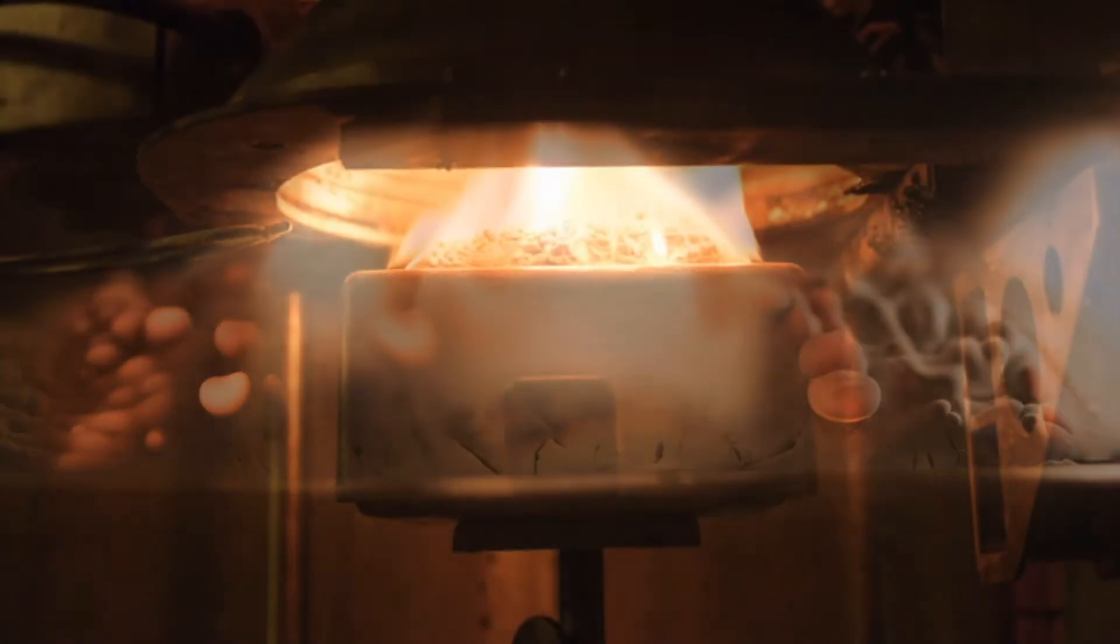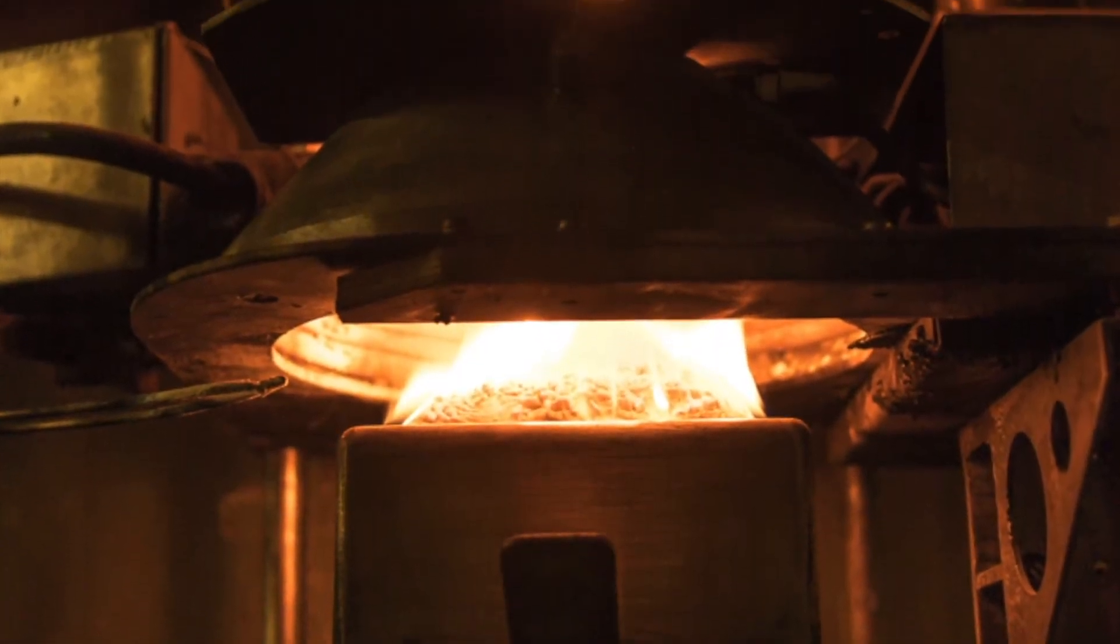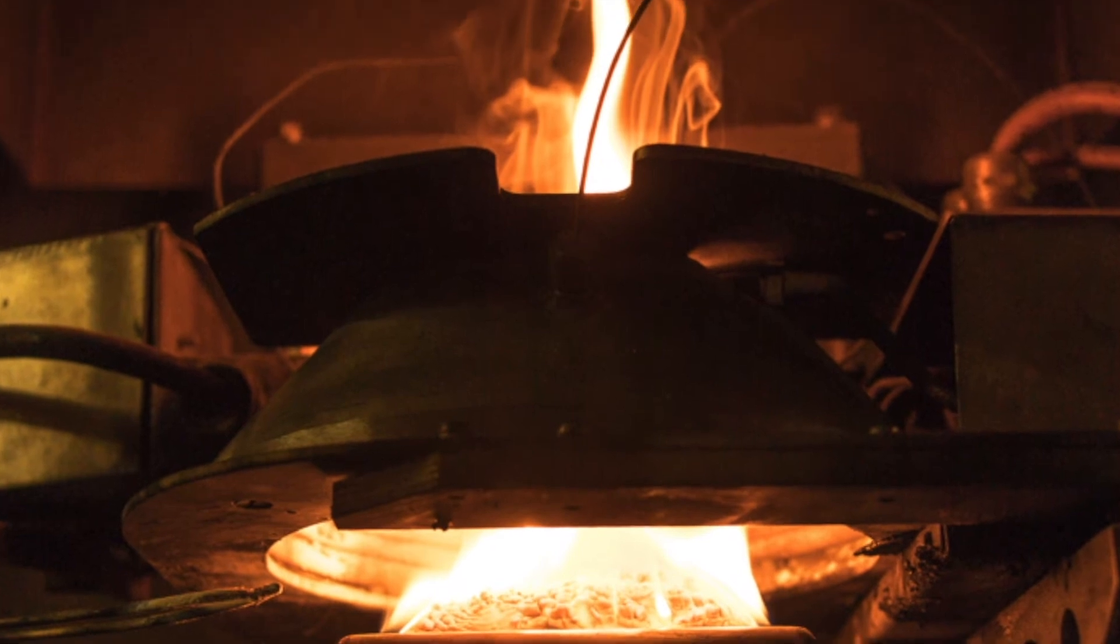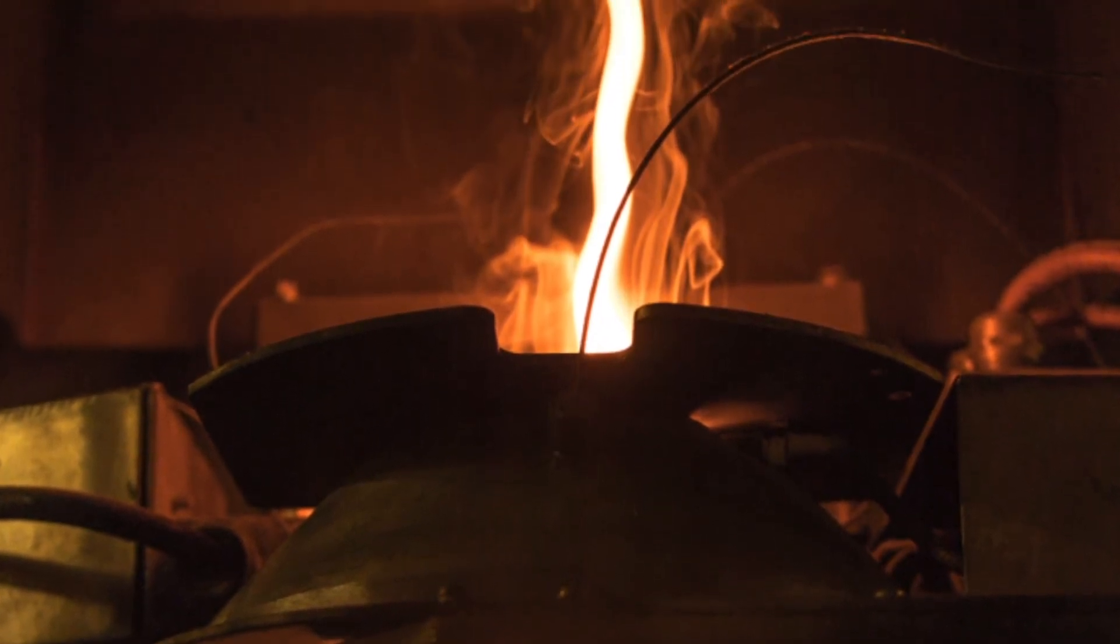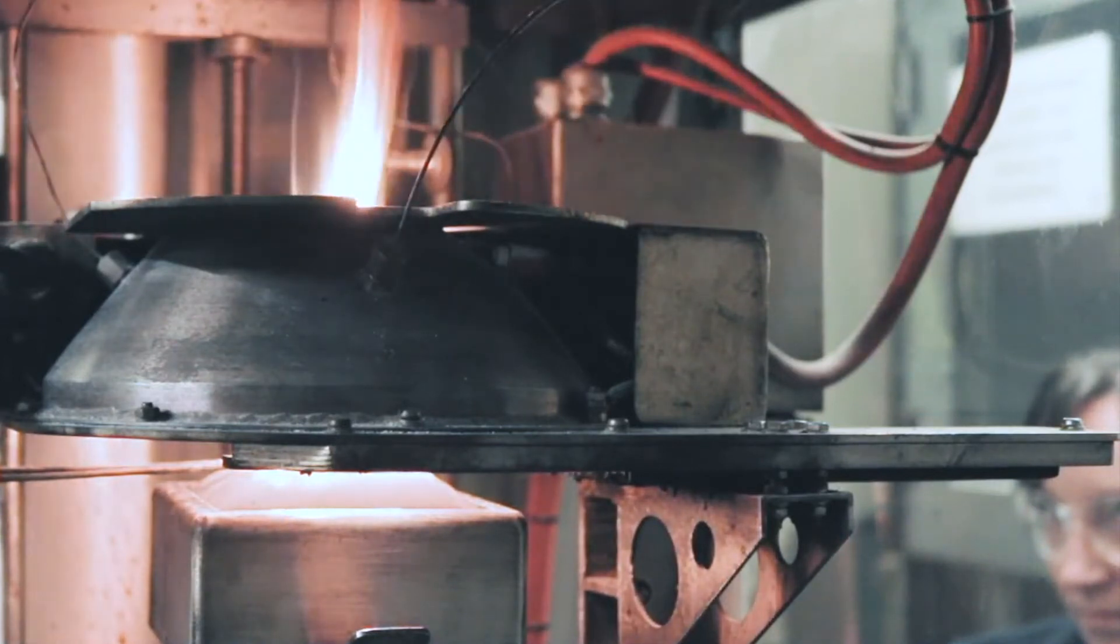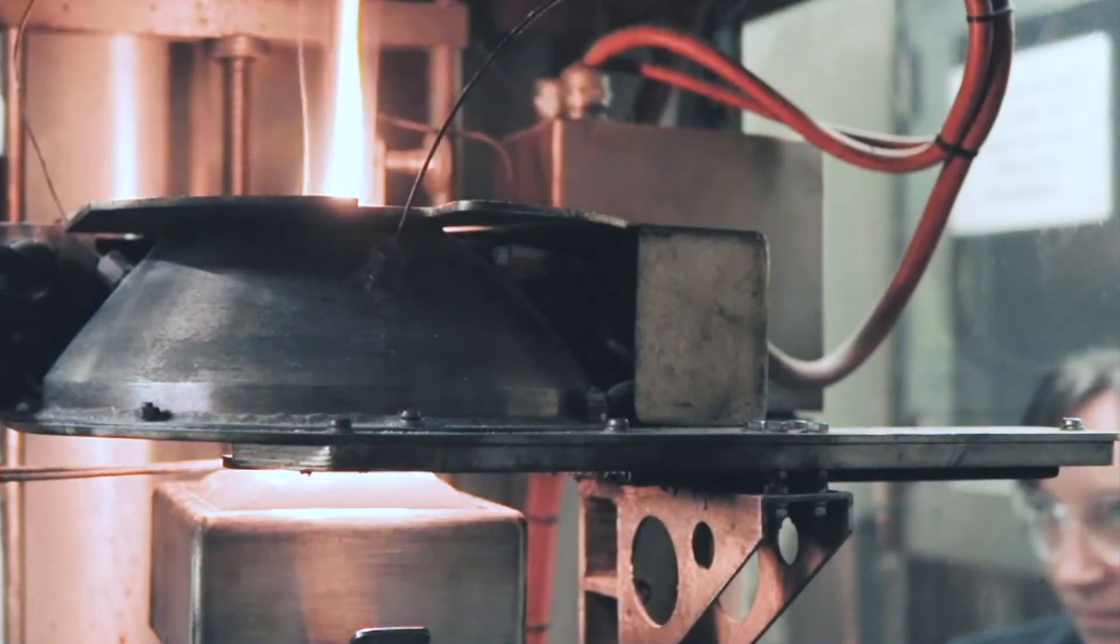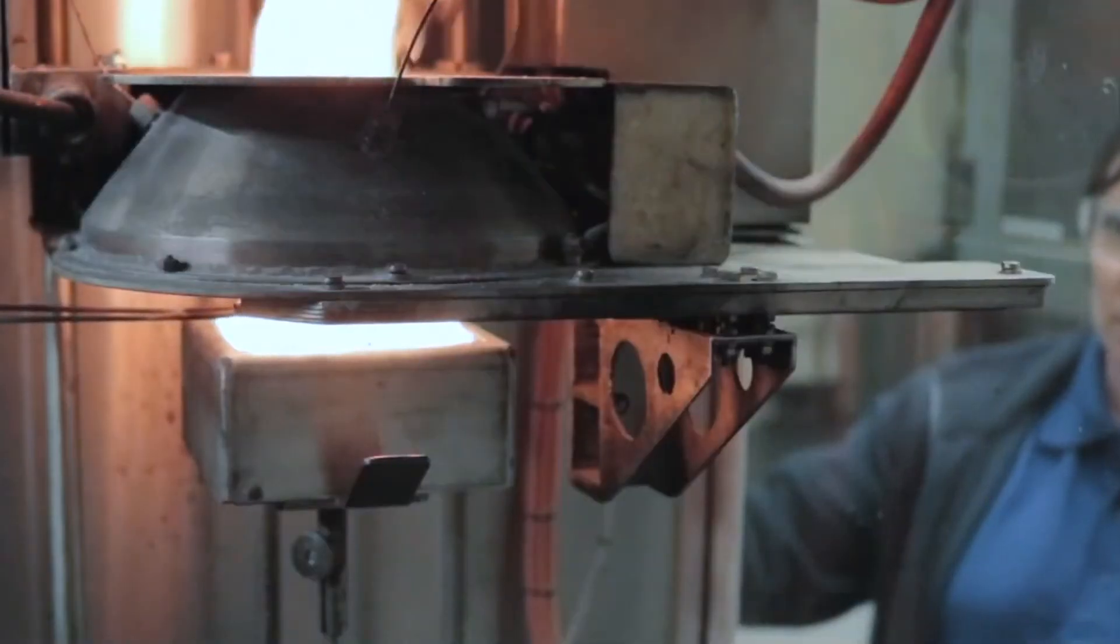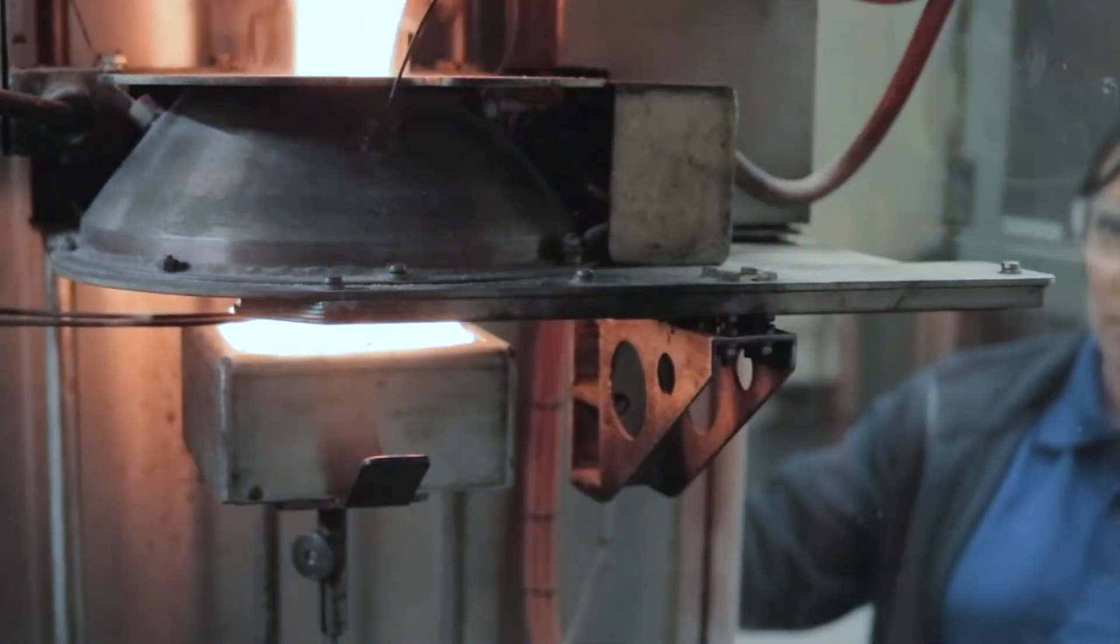Fire tests using the cone calorimeter involve exposing a flat specimen to an incident heat flux generated by the cone-shaped heating element. A spark igniter may be placed midway between the sample and heater and is used to ignite the combustible gases released from the material when the concentration reaches the critical level to sustain flaming.